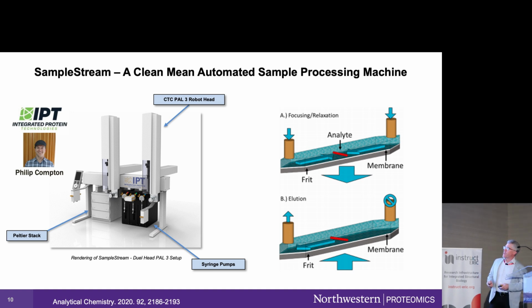I have a financial conflict with this startup company, but I'm excited about it because we've combined it with sample prep. So we're automating sample prep, sticking it next to that technology I just showed you, which is called direct mass technology by Thermo. And so this is basically a protein washing machine. It's a protein concentration device and buffer exchange all in the same format.